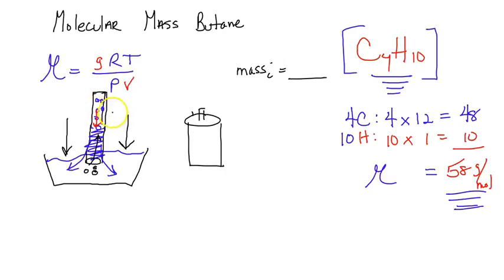And that downward pressure is opposing the atmospheric pressure. Now, of course, if the pressure in the flask here was equal to the atmospheric pressure, it would push down until they're equal. And that's where we're talking about manometers.